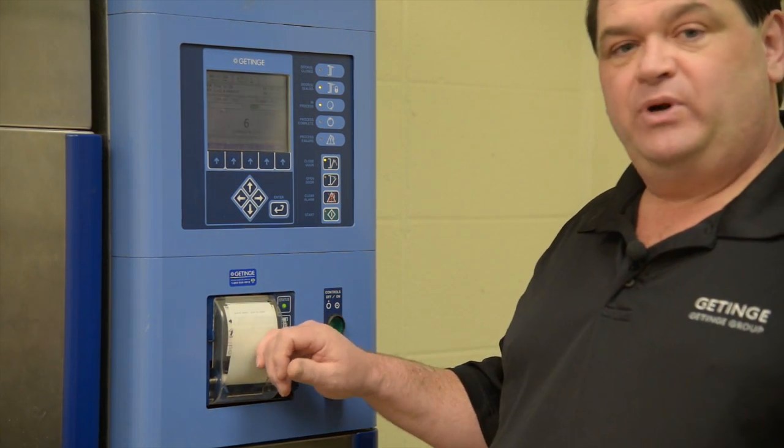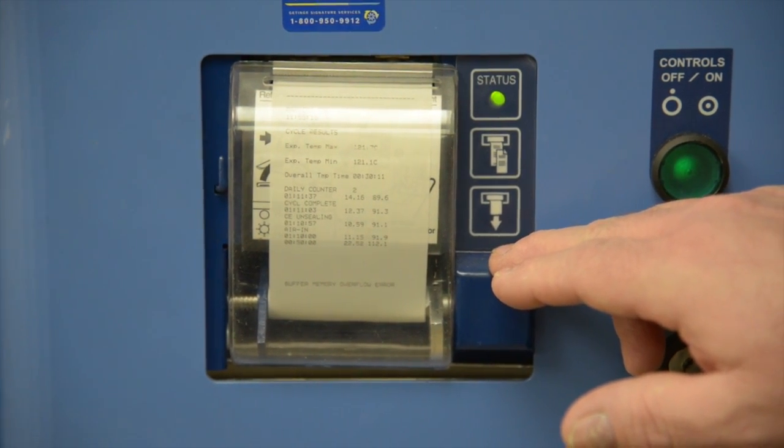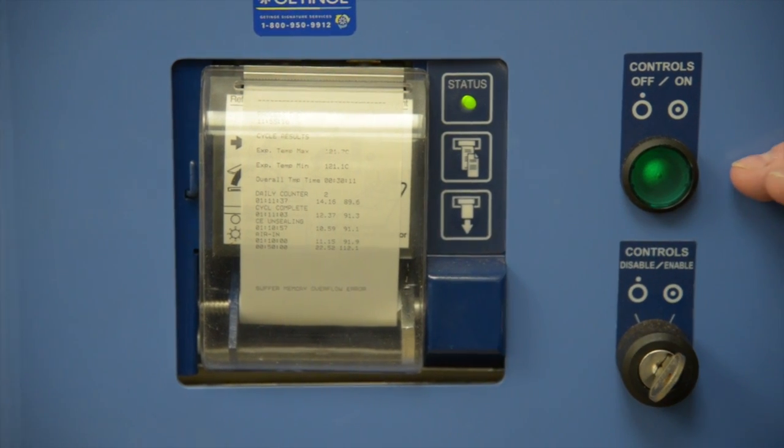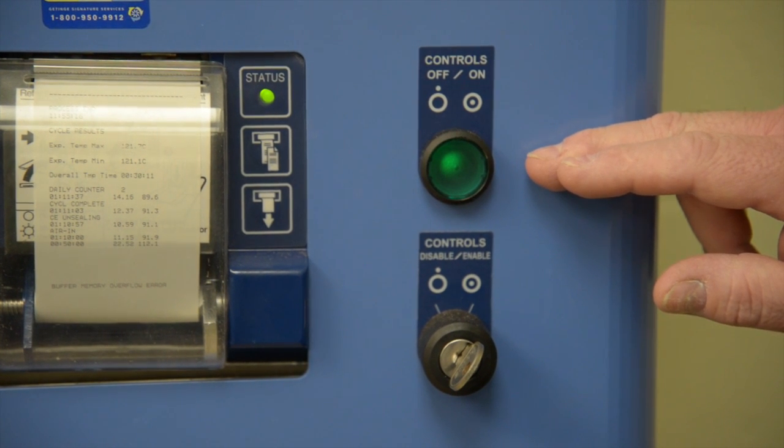Next we have the printer which keeps a running log of the cycles that you're running, the control on/off button, and then the control disable/enable key.